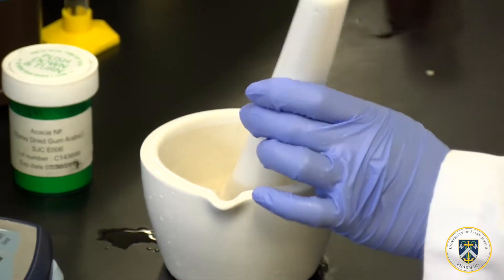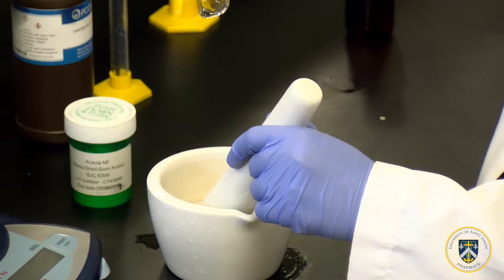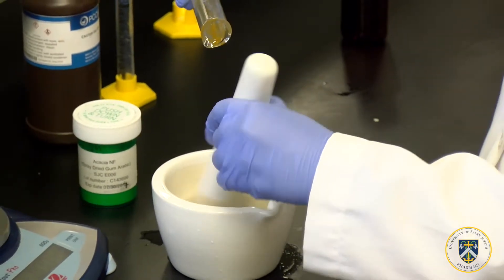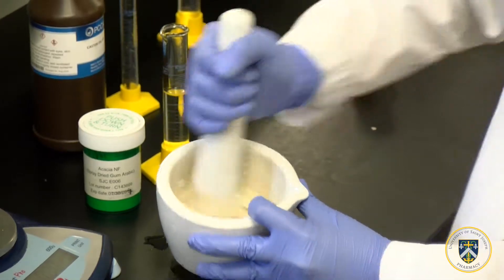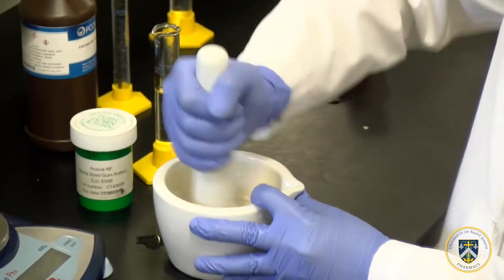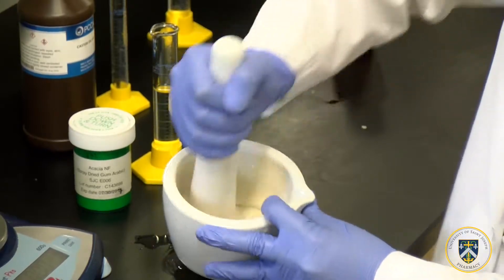Now I have the castor oil and I'm going to add it drop by drop while mixing or triturating vigorously. The key is to make sure you hear the sticky and clicking noise, and make sure you don't add too much oil all at once.